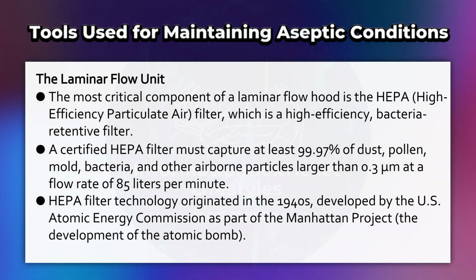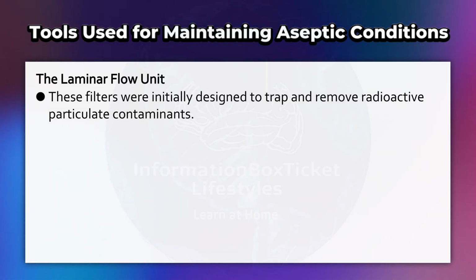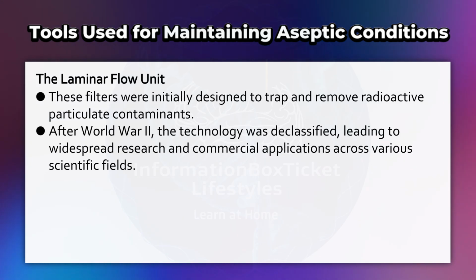Atomic Energy Commission as part of the Manhattan Project, the development of the atomic bomb. These filters were initially designed to trap and remove radioactive particulate contaminants. After World War II, the technology was declassified, leading to widespread research and commercial applications across various scientific fields.